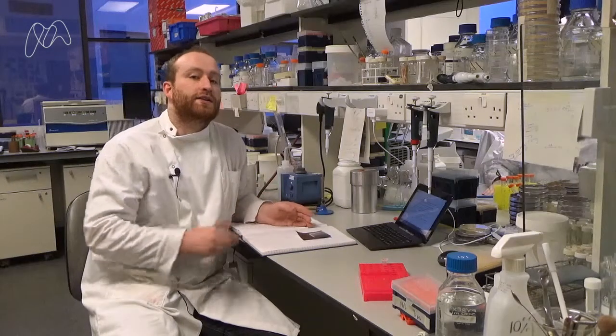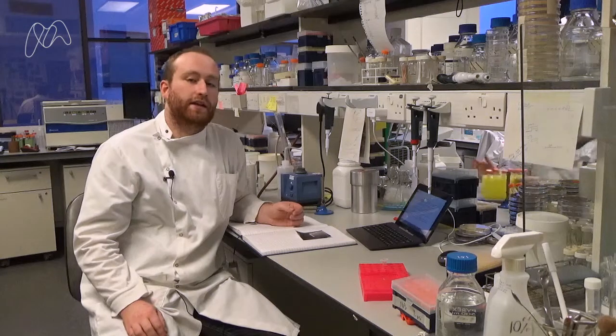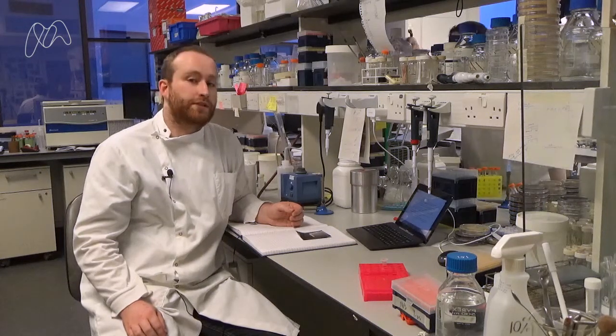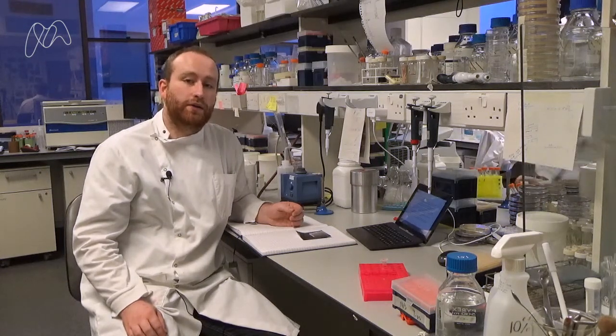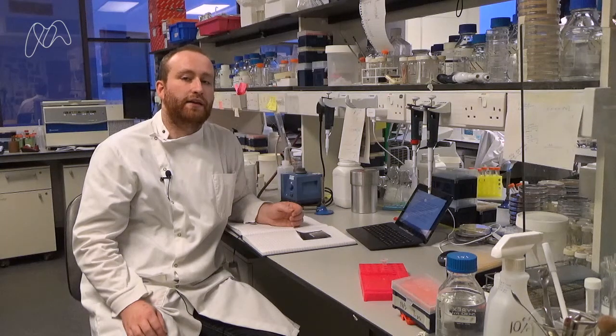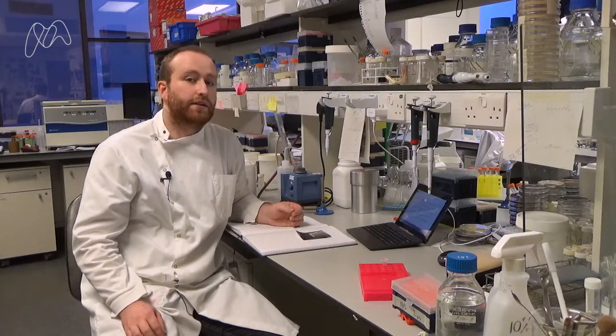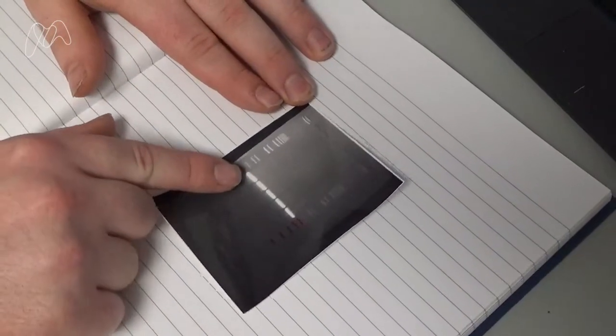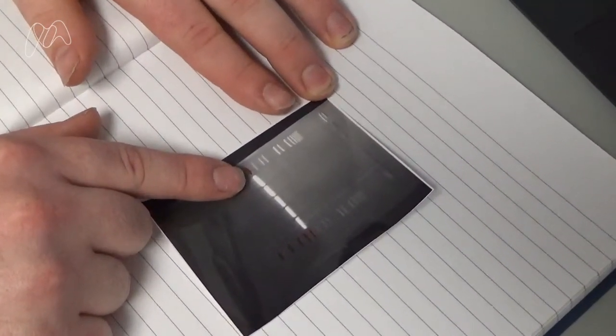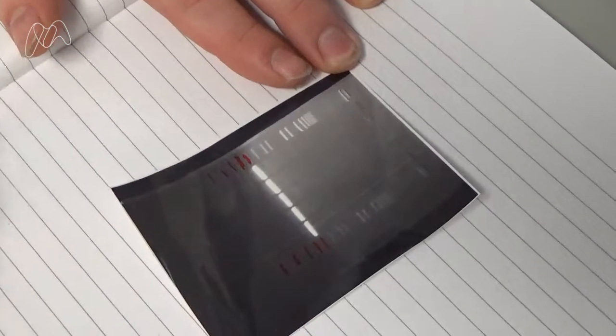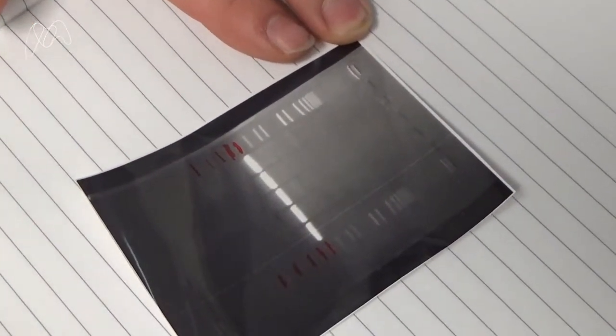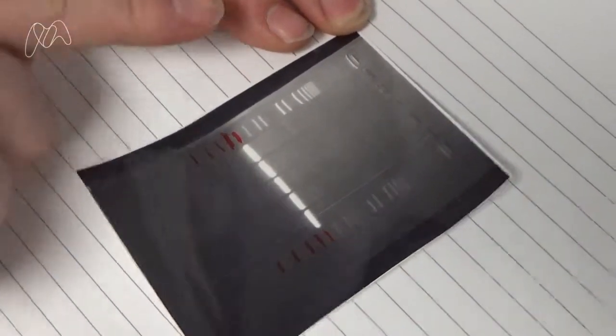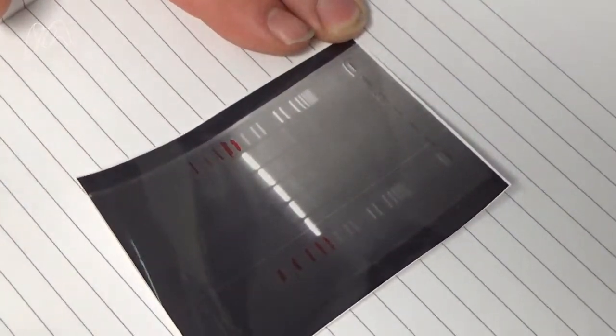What I have here is a picture of our gel taken under UV light. The gel that we put in the machine contains a special chemical that binds to DNA and glows under UV light, which allows us to see it. Here you can see a bright band in a lane where we added the bacterial DNA from the PCR. The band tells us how far the fragments have traveled, but how can we tell what size they are?